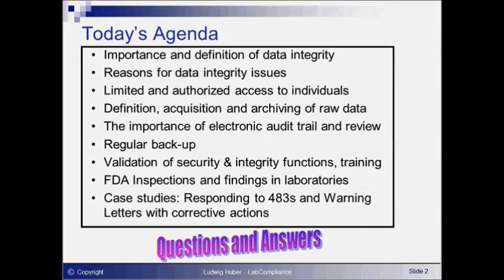And FDA has also put a lot of emphasis on complete records, so I will talk about what they are, including raw data and electronic audit trail and its review. They play a major role in defending data integrity, so I will spend quite some time here. Next I will talk very briefly about backup, because this is not mainly a compliance concern, this is also a business concern, so I assume that you're already familiar with this requirement.